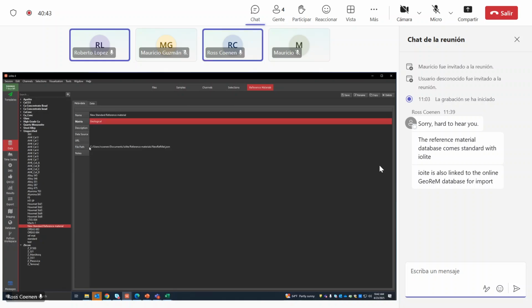Hold on, I'm trying to find the right word. Again, if he analyzes a triplicate for reference, can he get the average at the final analysis?